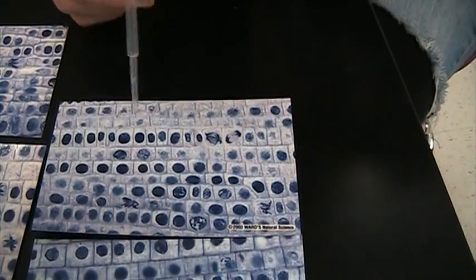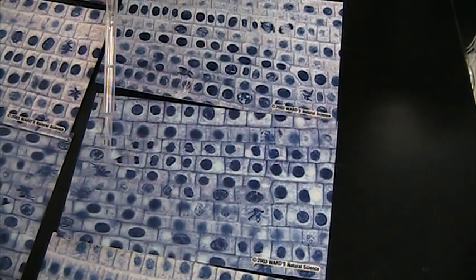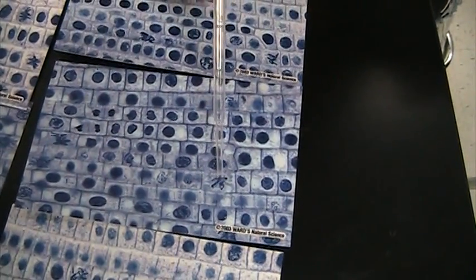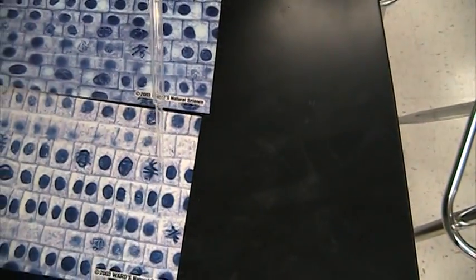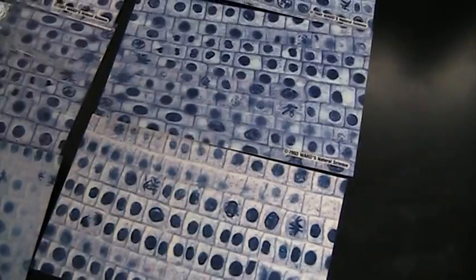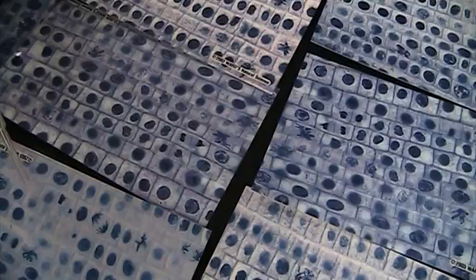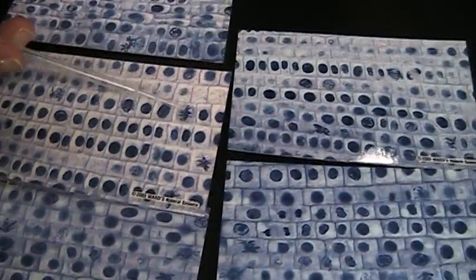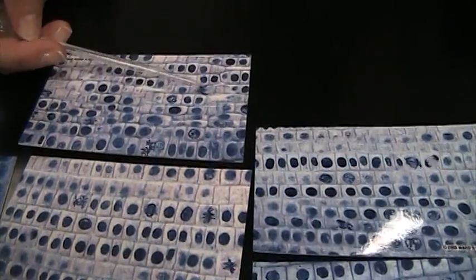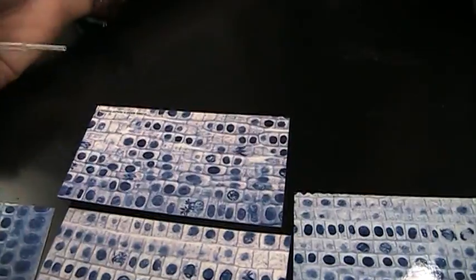Metaphase. In metaphase your chromosomes line up on the metaphase plate, which is an imaginary plate. So you can see a line with some chromosomes coming off of it. This is metaphase. This would be kind of metaphase. Any time you see a line, this would be metaphase. Maybe metaphase here, maybe here, definitely here. So those chromosomes are lining up in the center of the cell. That's metaphase.